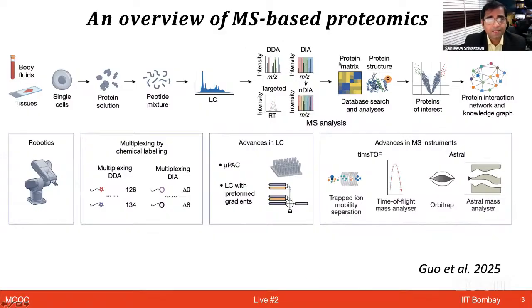So these are the kind of, as I said, this is the theoretical part. This can be quite important, and it has a lot of detail. Additionally, one could now look at validating your targets and do the targeted analysis and different types of analysis. Targeted proteomics itself has a lot of interesting things to talk about, especially the two workflows of MRM, multiple reaction monitoring, and PRM, parallel reaction monitoring. With all of that we can look at a specific peptide, and we want to validate those peptides. So that we'll talk about as we go along.